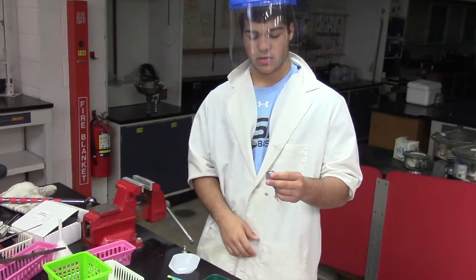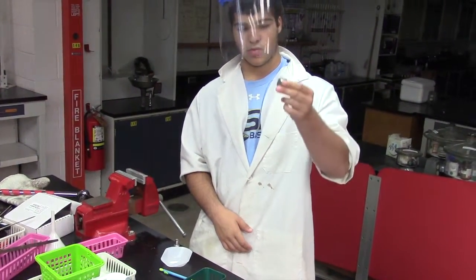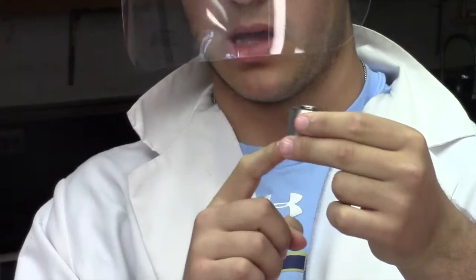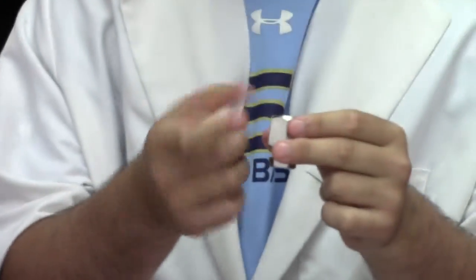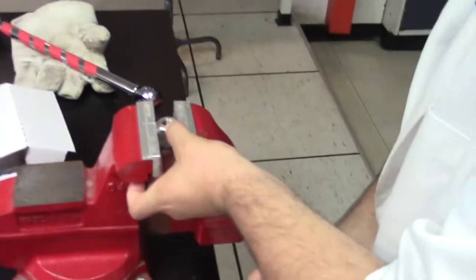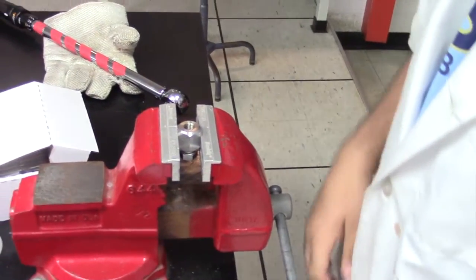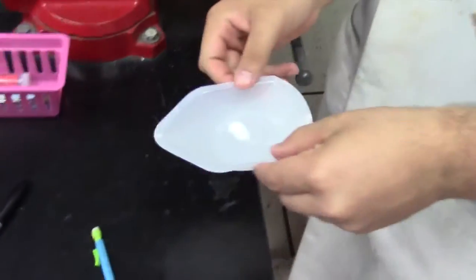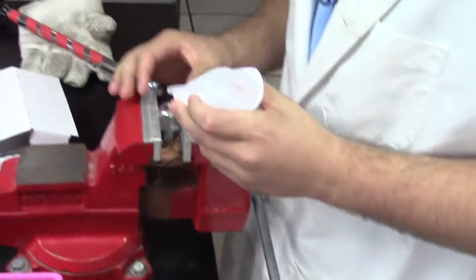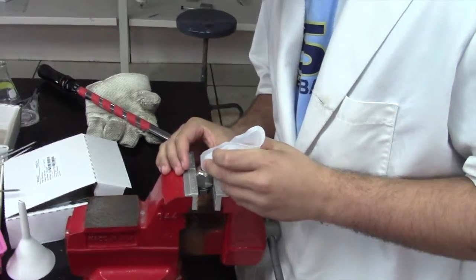Now to make your KBr salt plate, first what you want to do is insert 1 bolt into the bottom side of the nut and screw it in until you get about halfway up. And then you can insert it into the clamp. Make sure it's nice and tight. And then we insert our sample and KBr mixture into it.